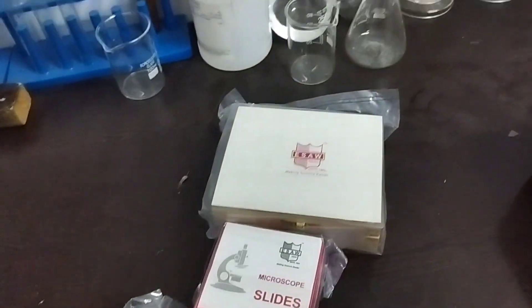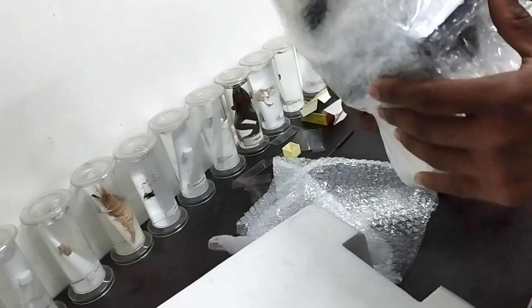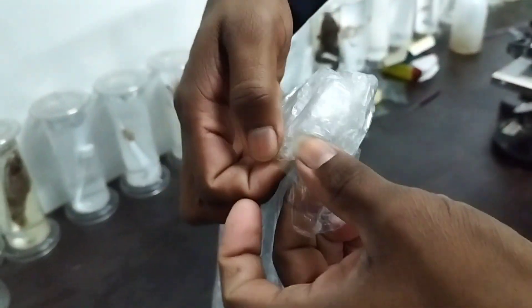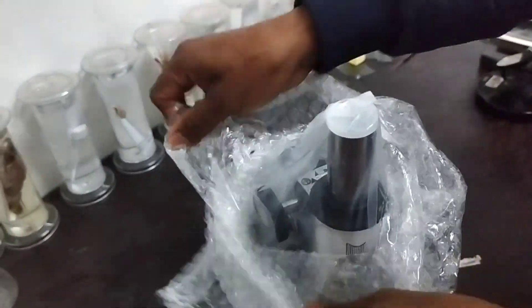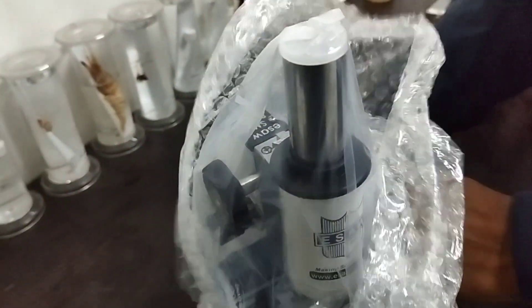This is the main microscope, thermocol packed with bubble wrap. Let's open the bubble wrap — this microscope comes along with so many accessories.